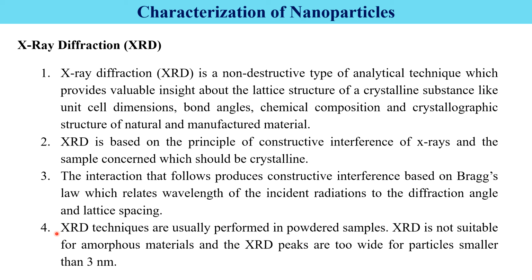We know the Bragg's equation. XRD techniques are usually performed on powdered samples. XRD is not suitable for amorphous materials, and the XRD peaks are too wide for particles smaller than 3 nanometers.